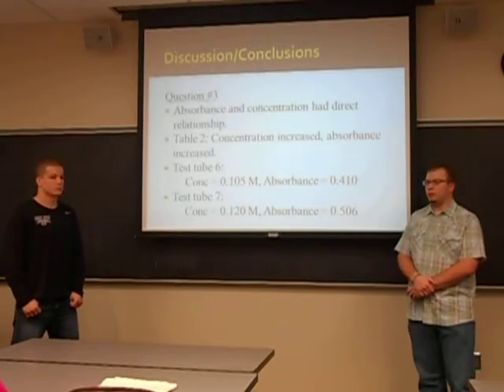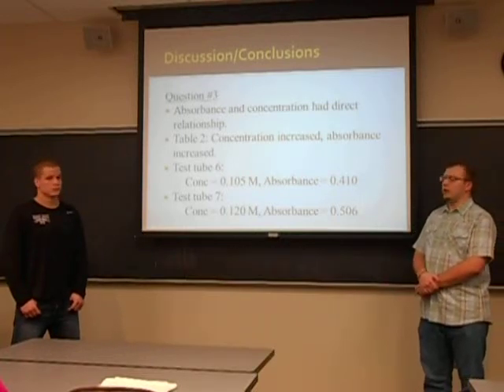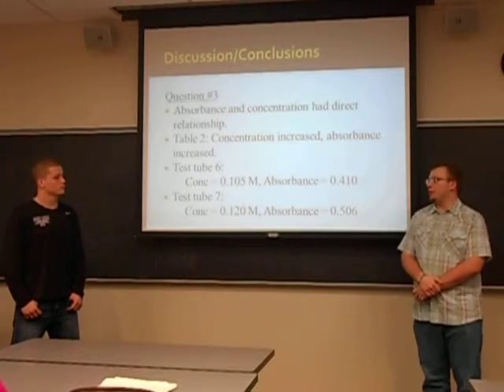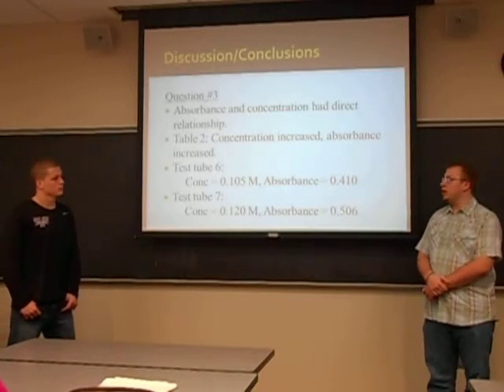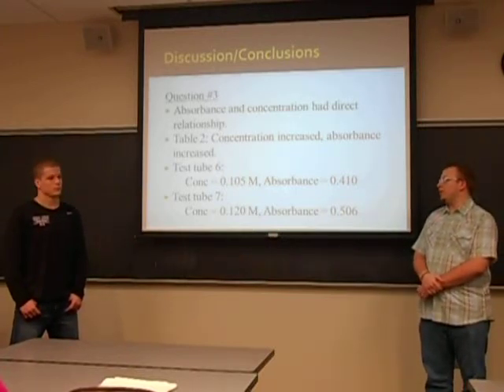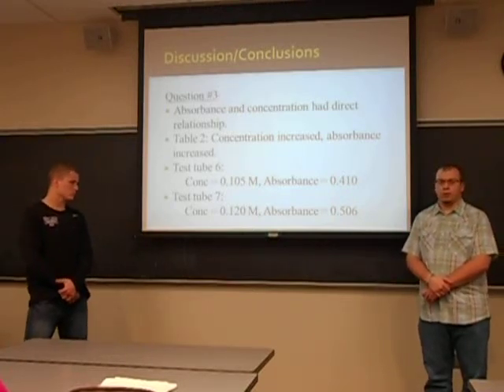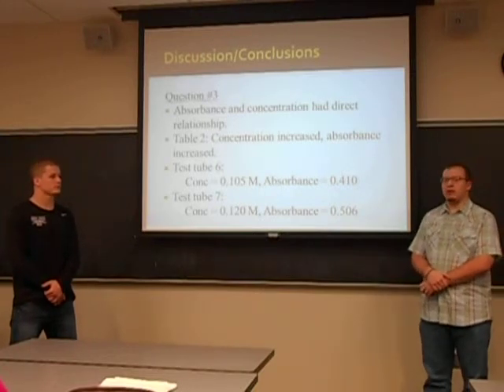We found out that the absorbance and concentration had a direct relationship. This is seen in table 2. When the concentration increased, so did the absorbance. In test tube number 6, the concentration was 0.105 molarity, and the absorbance was 0.410. In test tube number 7, when the concentration increased to 0.120 molarity, the absorbance also increased to 0.506.